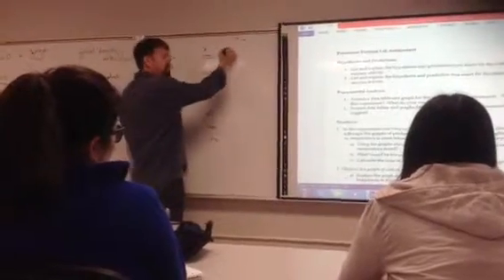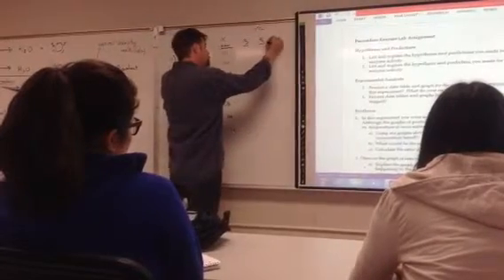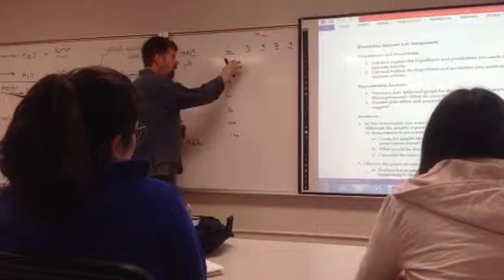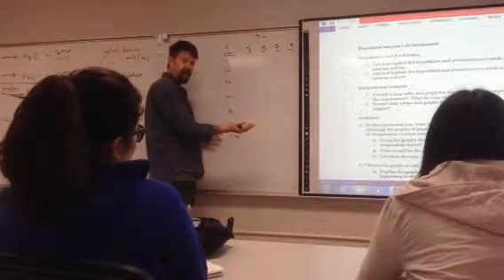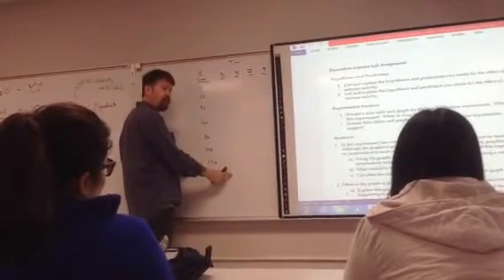So we saw, what pHs did you use? 3, 5, 7, and 9, like that. And then what goes in the data table are the data you collected, right? This is absorbance, you read, right? So you put the thing in and you read it and you saw what happened.